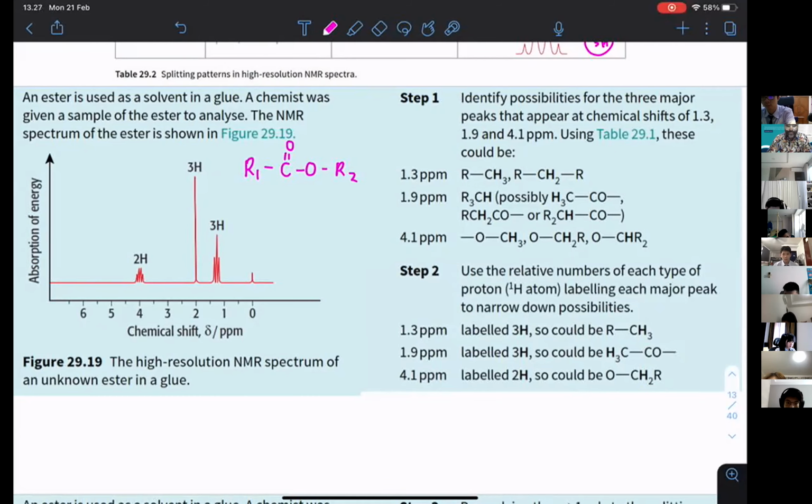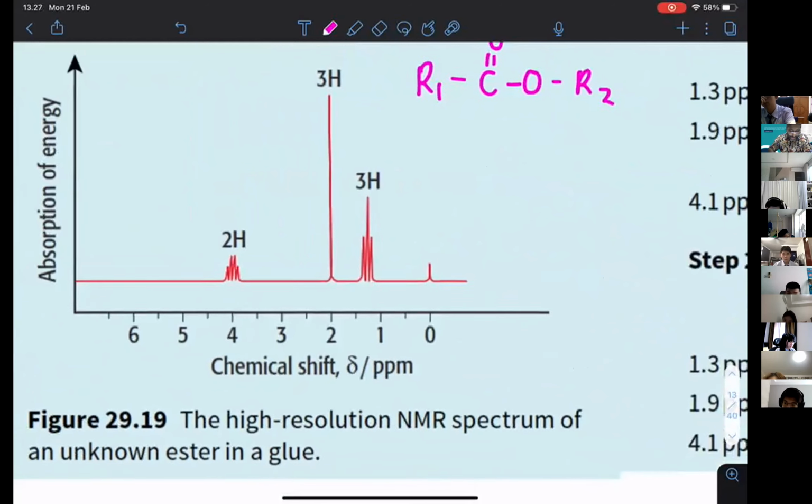But just before that, Wilson, is this low resolution or high resolution? Is it high, sir? Yes. Why? There's the triplet. The moment you see splitting, splitting doesn't exist for everything, but the moment you see splitting, which you can see here, and then here, this is high resolution.